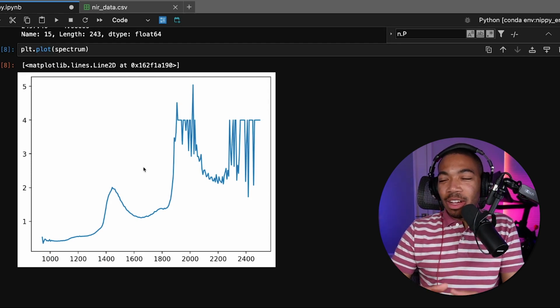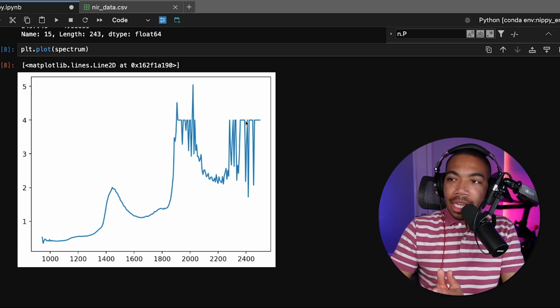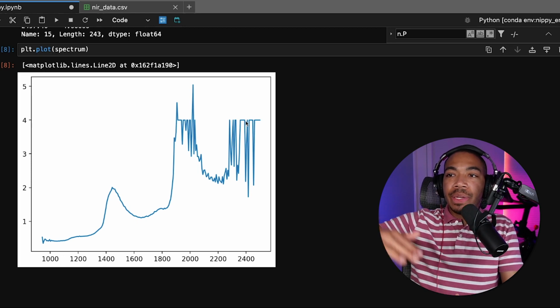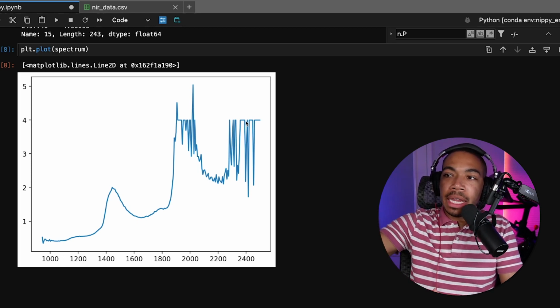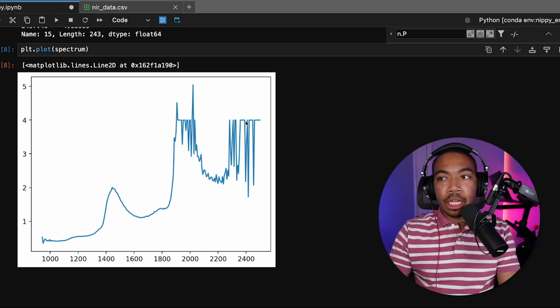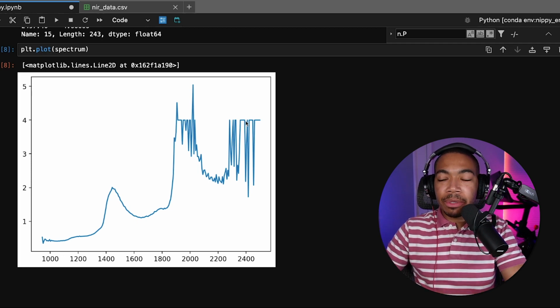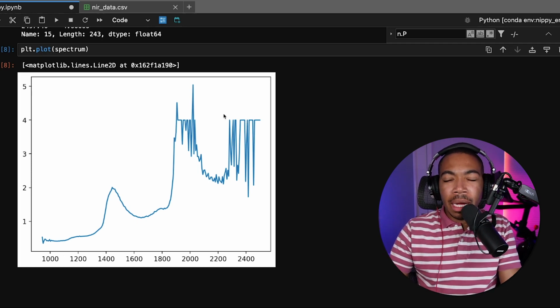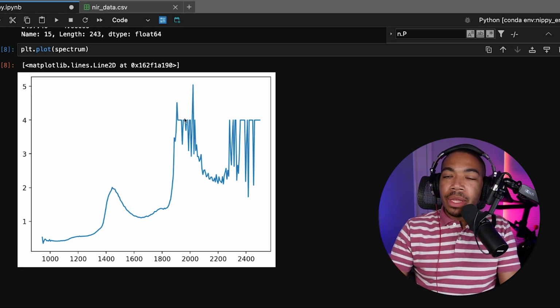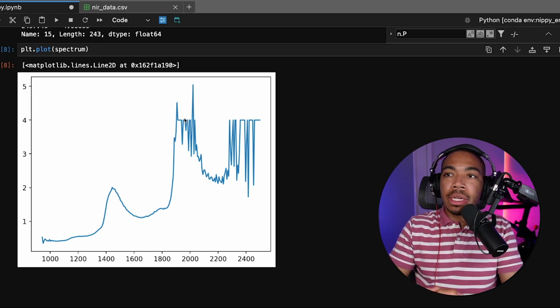So I'm an analytical chemist, and when you see these flat tops, it very likely means you're saturating the detector. We're losing some information because we don't have a response higher than that. Of course, if I were running a real experiment or if this were my data, we would be adjusting the concentration of the samples down to ensure we have some linear response, or at least attempting to correct this. So again, this is just sample data produced by the authors of this library.